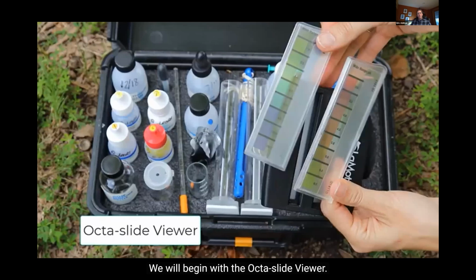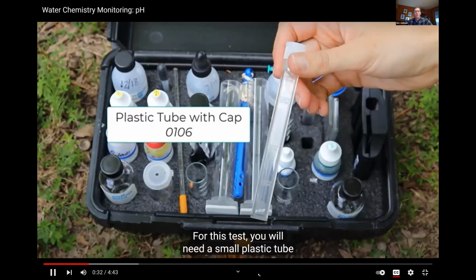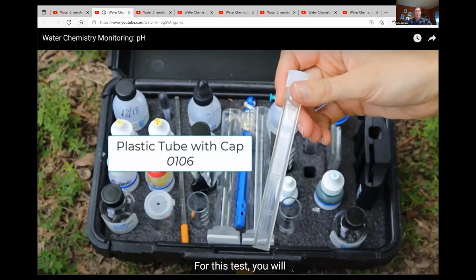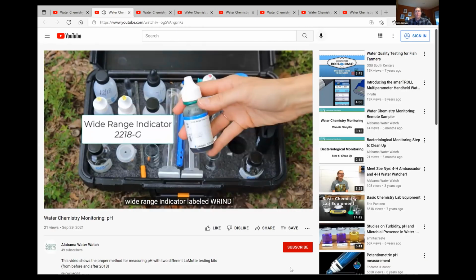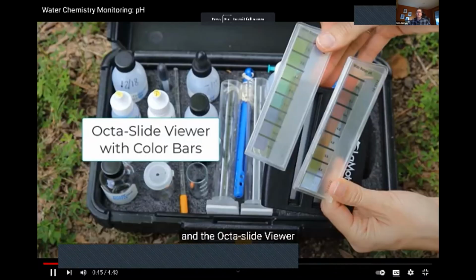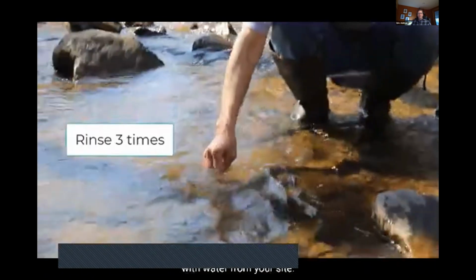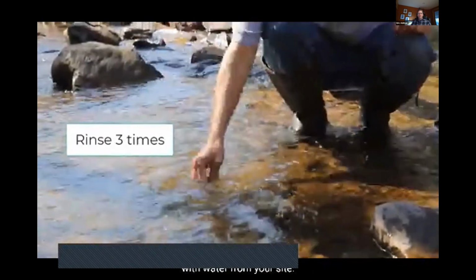We will begin with the OctaSlide viewer. For this test, you will need a small plastic tube with a cap, code 0106, wide range indicator labeled WRIND, code 2218-G, and the OctaSlide viewer with OctaSlide color bars. Remove the small plastic tube from your kit and rinse 3 times with water from your site.